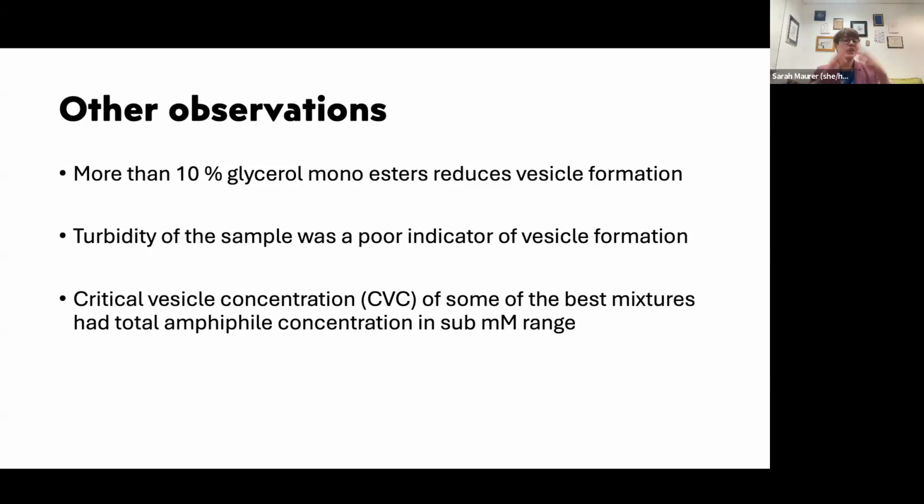All right. The other thing that has happened from this project is that we have a lot of questions. This is a great opportunity for exploring different compositions of liposomes. And so we are thinking about this from a lot of different angles. Moving forward, we are trying to answer the question, how do we get functional vesicles, and thinking about what that means.